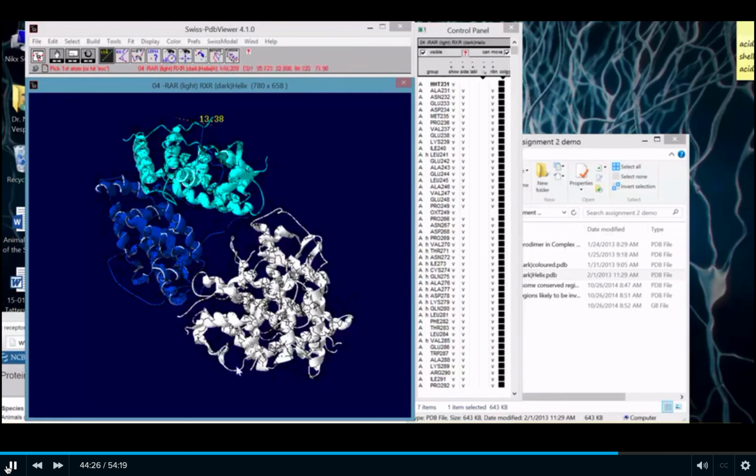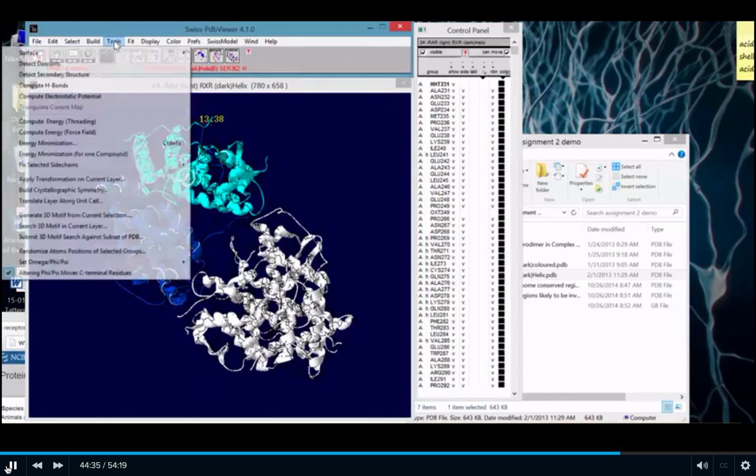And again, if you make a mistake, that report tells you where things are colliding. So you might be able to tweak things a little bit differently if you look to see where those residues are. You don't have to do folding. You can do a whole bunch of other things. It all depends on what you're doing when you're approaching this question.